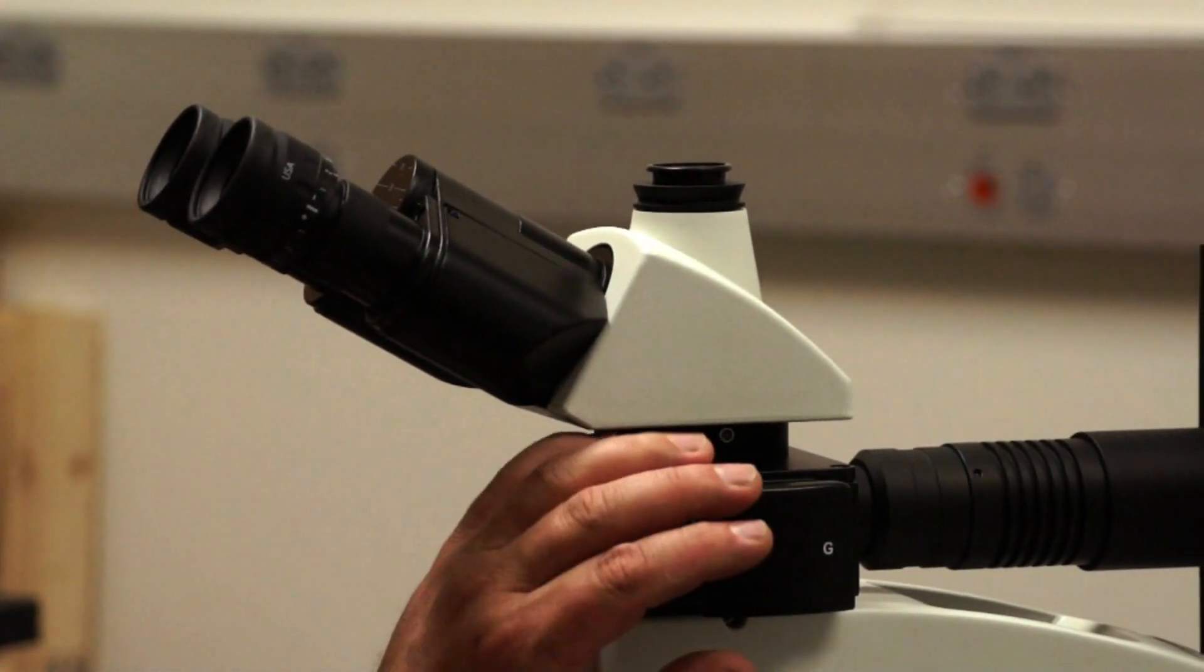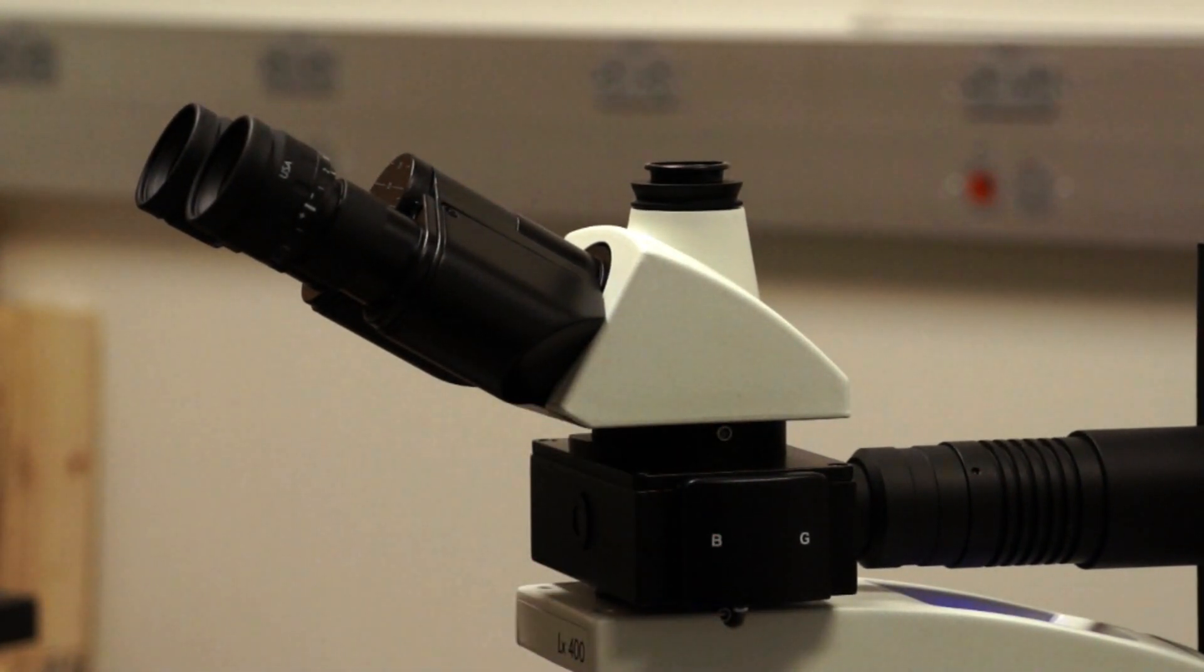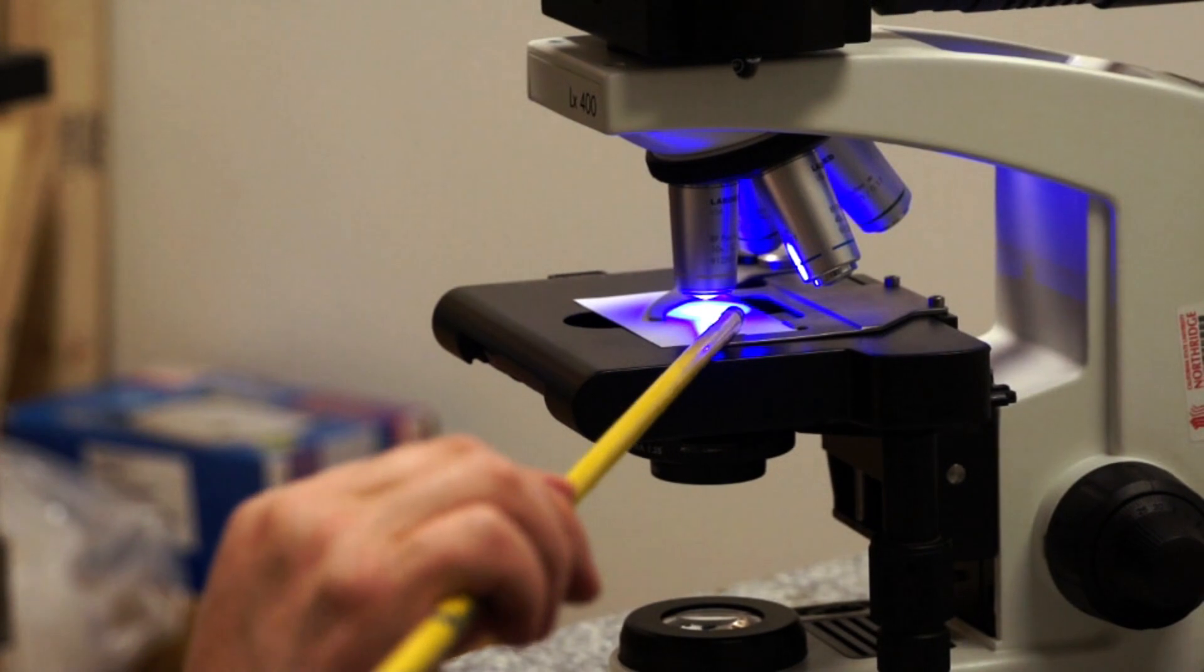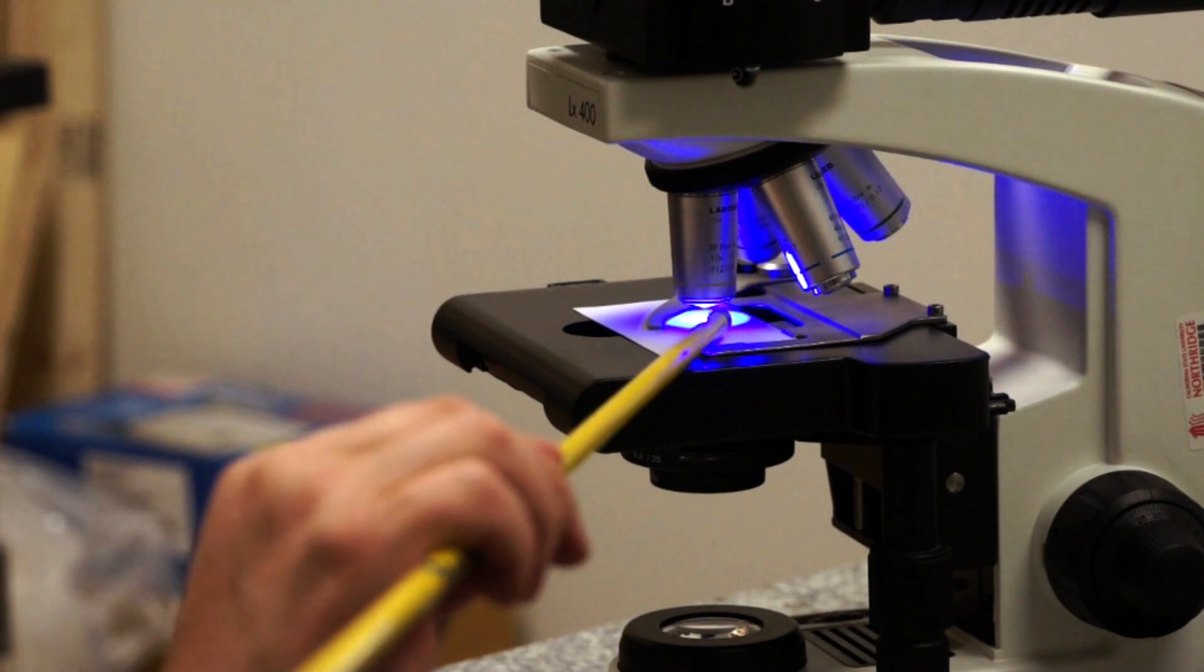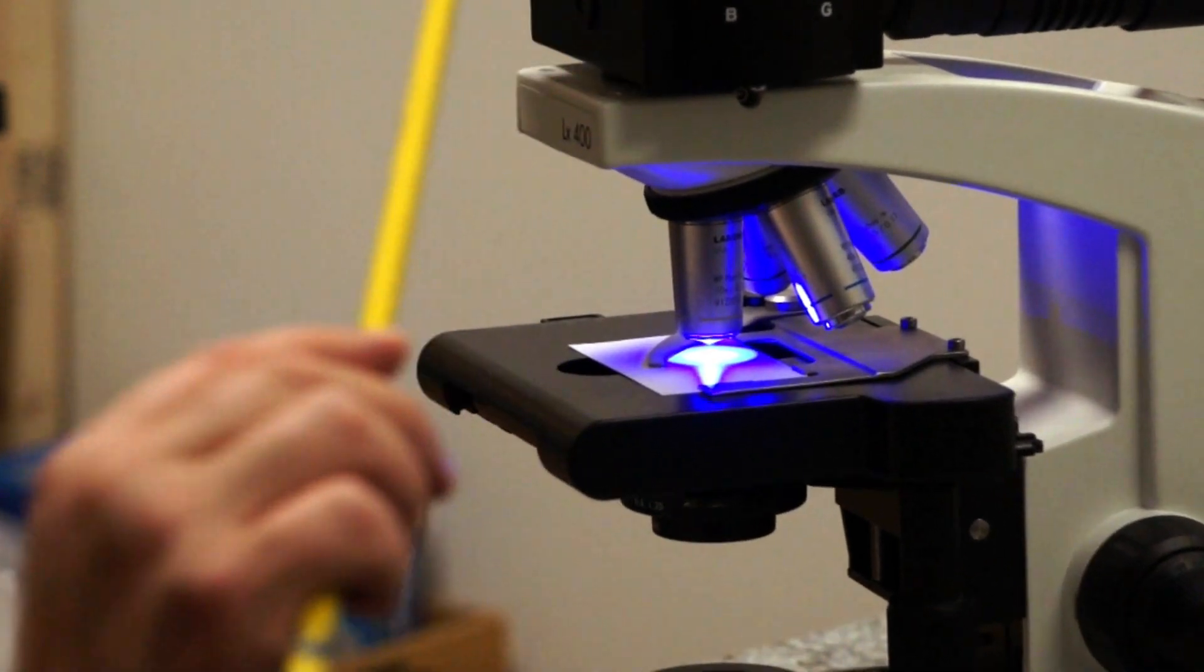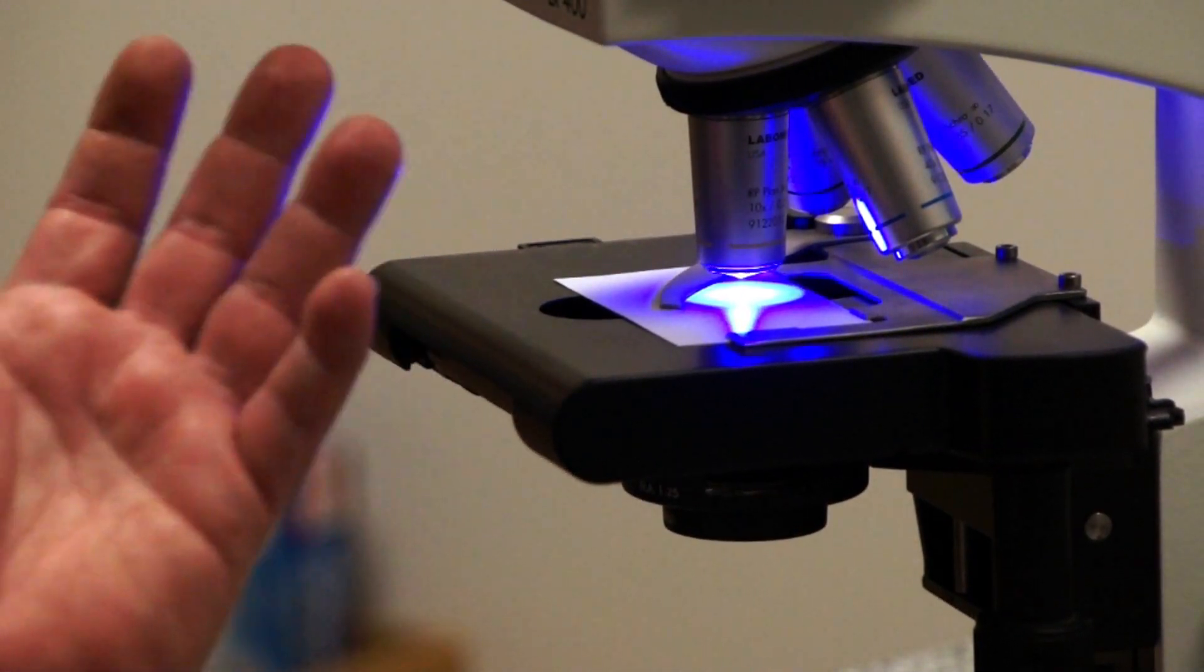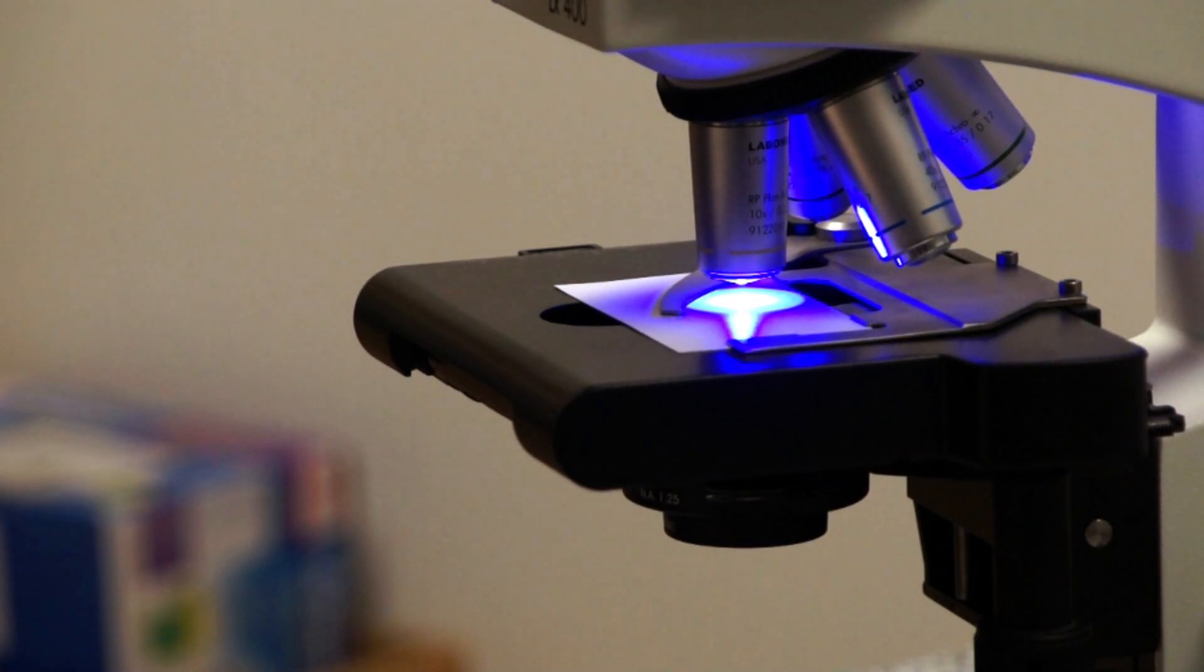So if I push a set of filters into the light path, you'll see the bright blue light. What is this light? This is about 490 nanometers of light that is being used to excite our specimen. We'll discuss more about excitation and emission later. But the light that comes off the specimen, or the emission light, travels through the objective and to the observer's eyepieces. This is very low light, and therefore you will often see a fluorescent microscope used in a dark room. Now we're going to go to the diagram and show you these features on the diagram as well.